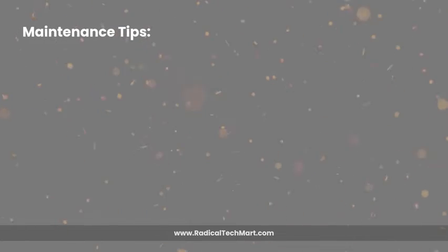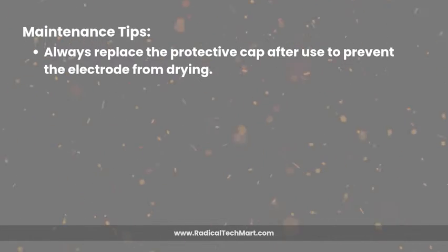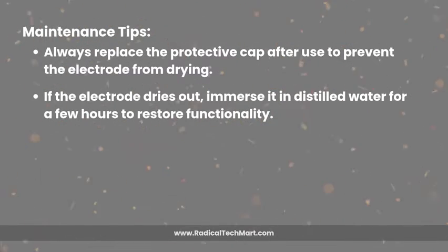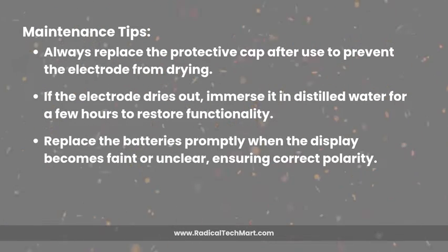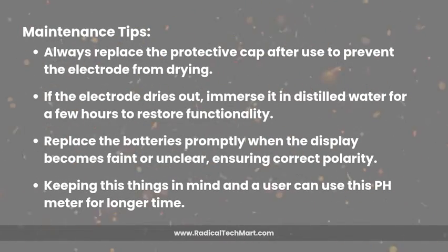Some maintenance tips that a user should keep in mind: always replace the protective cap after use to prevent the electrode from drying. If the electrode dries out, immerse it in distilled water for a few hours to restore functionality. Replace the batteries promptly when the display becomes faint or unclear, ensuring correct polarity. Keeping these things in mind, a user can use this pH meter for a longer time.